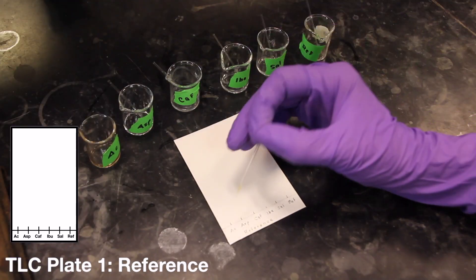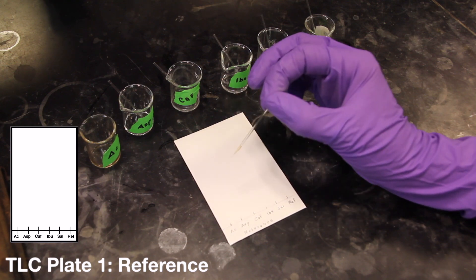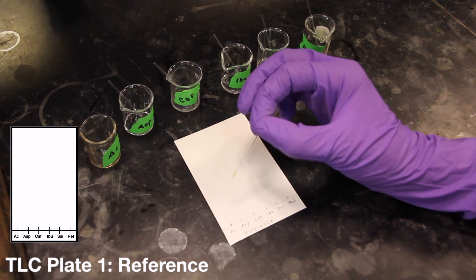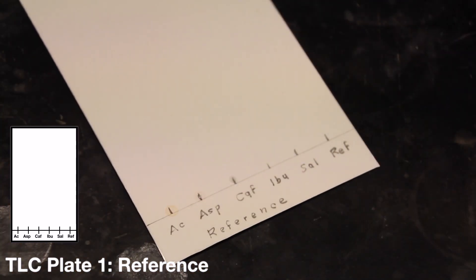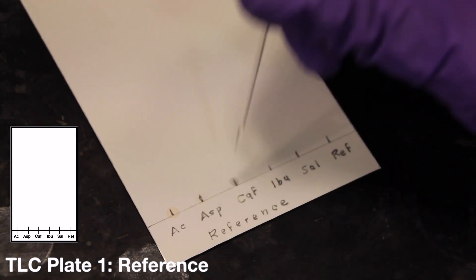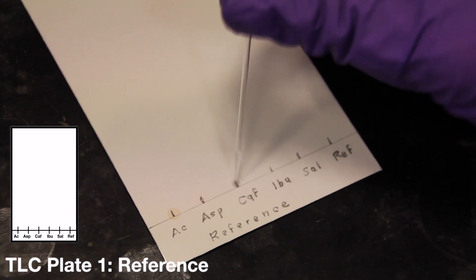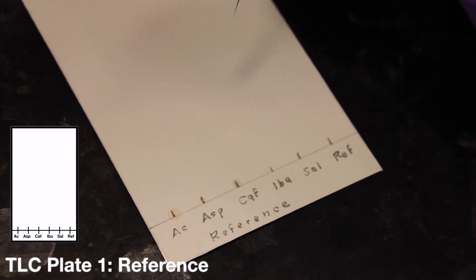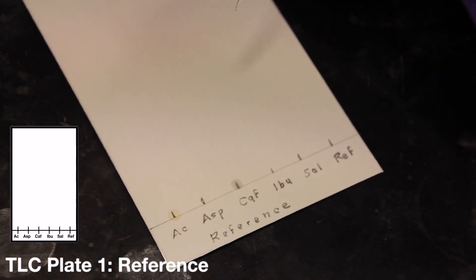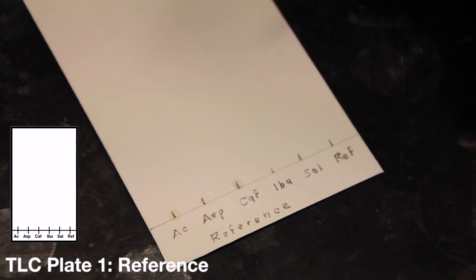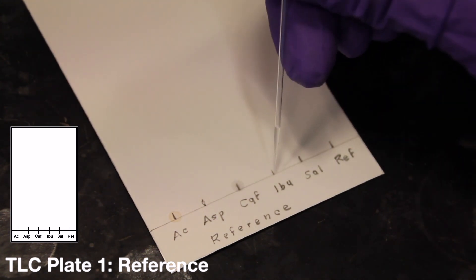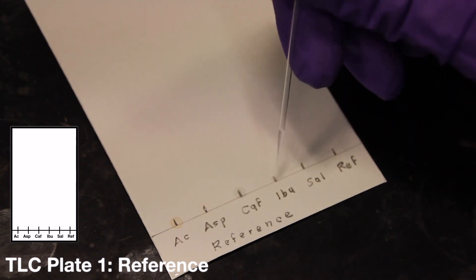Use the microcapillaries that you have prepared for the application. It is important that the spots be made as small as possible. The best results are going to be obtained by applying 5 quick touches of solution at each spot, allowing the spot to dry thoroughly between touches. Try to keep the spots no bigger than 2 mm in diameter. If the spots are too big, or if too much sample is applied, the spots will overlap one another after development, making interpretation difficult.